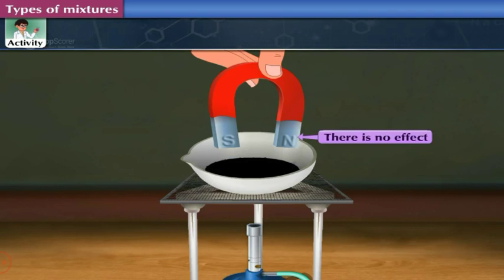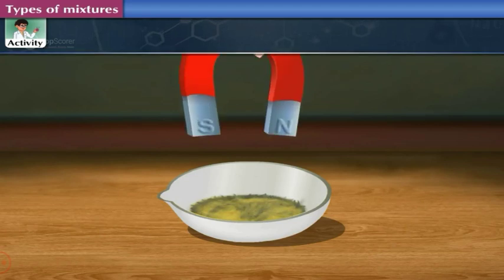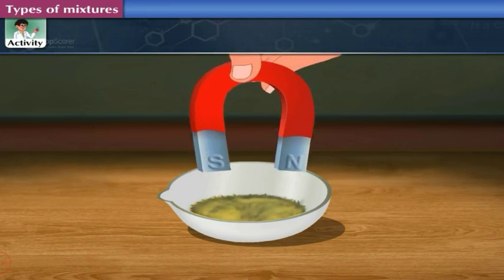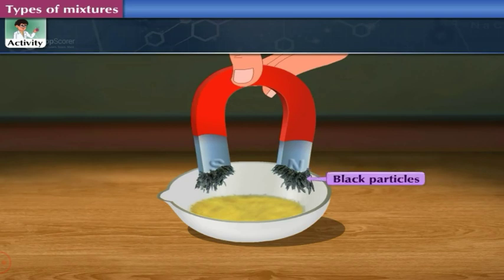Let us draw conclusions from this activity. We saw that when the magnet was brought near the matter obtained by mixing iron filings and sulfur powder, the iron filings cling to the magnet. The black particles seen were the particles of iron, and the yellow particles seen were the particles of sulfur.